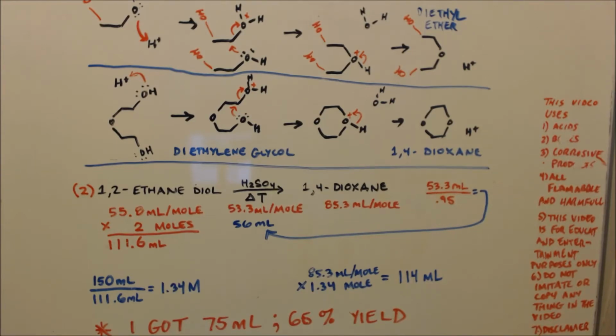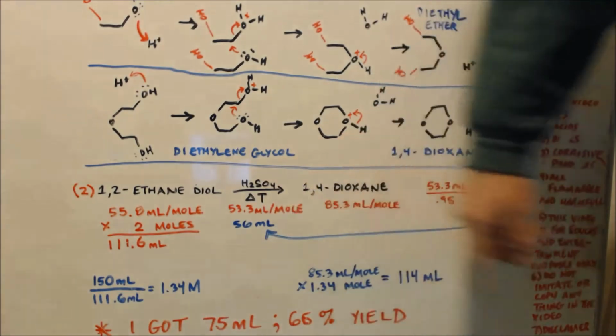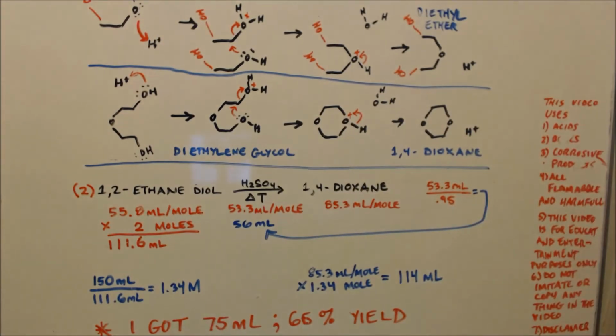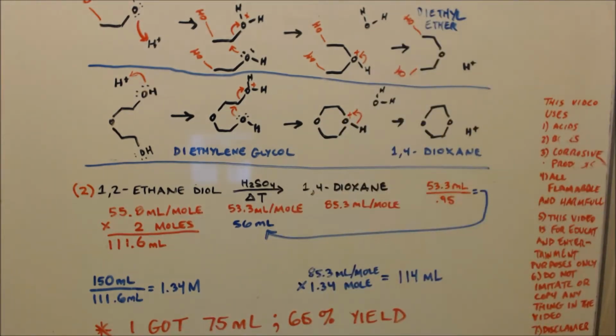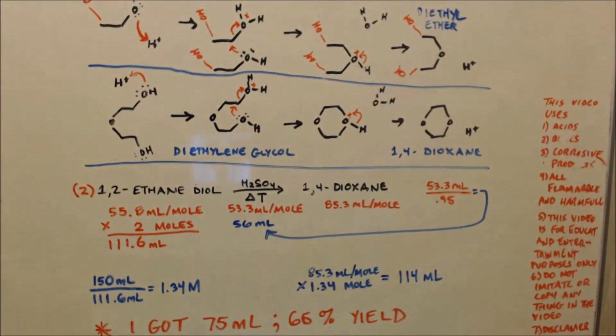Alright, the reason I used the amount of acid I did, that's the molar mass. I divided it by 0.95 because I have 95% sulfuric acid. So I should use anhydrous as much as possible. So that gives me 56. I times that by 1.34 that I got down from here. And that gives me 75 milliliters. But remember, it's only a catalyst. So I mean 10% would be a starting point. So I took 10% of that and it came out to 7.5 milliliters.